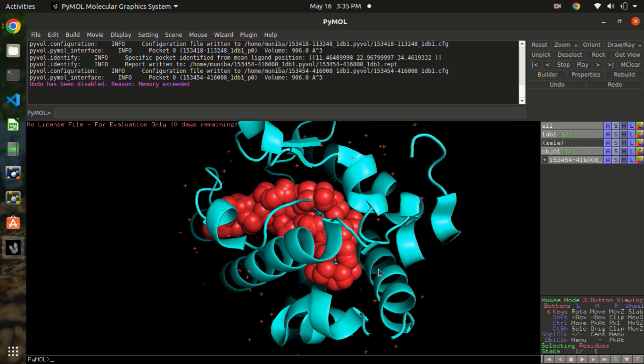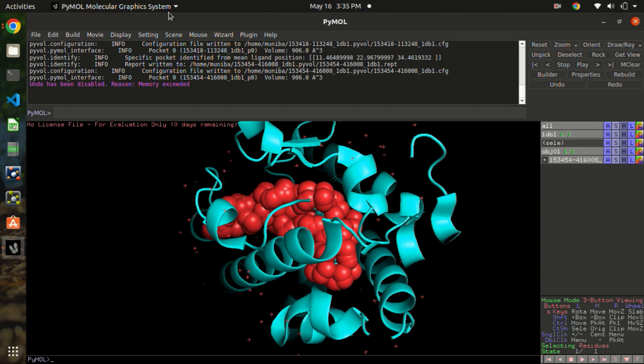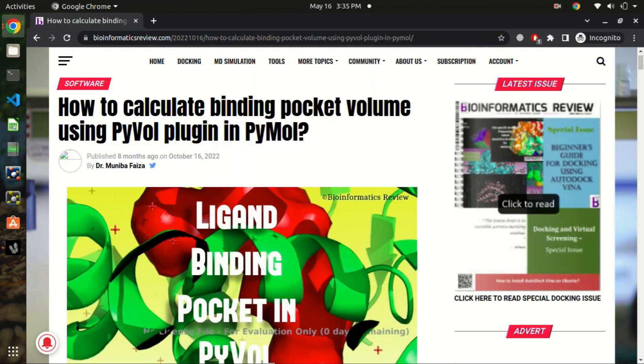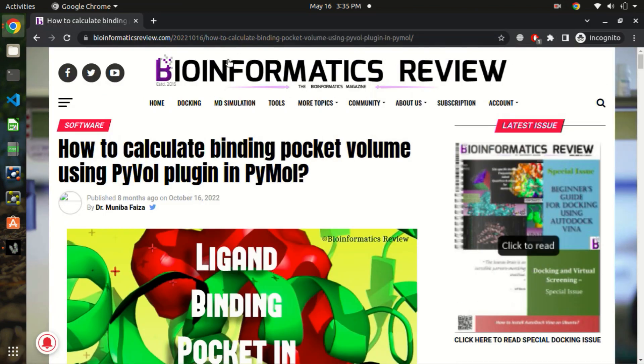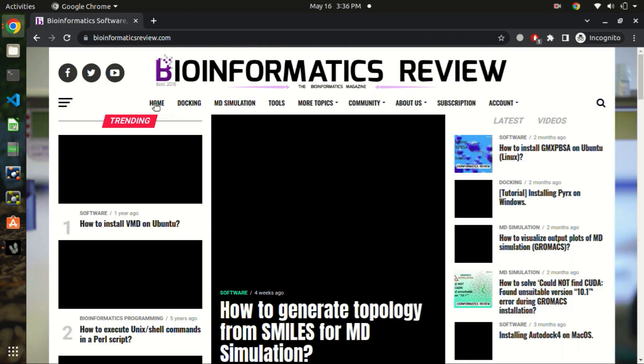That's about the binding pocket volume calculation using PyVol in PyMOL. And if you are interested in more bioinformatics articles, you can always go to our website and read many more articles on bioinformatics.